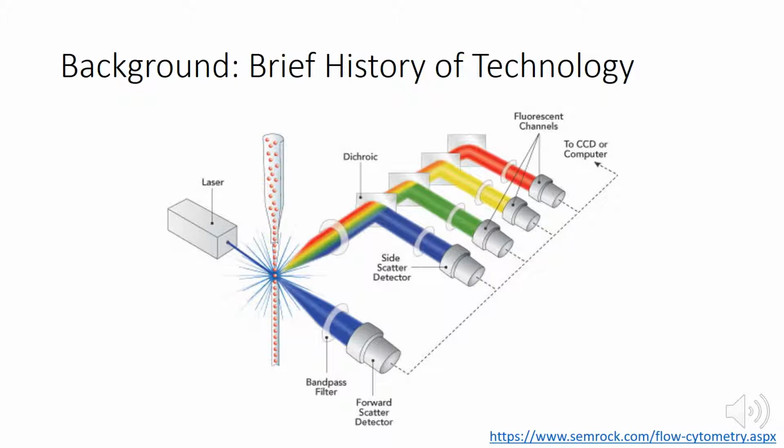One of the important criteria for flow cytometry is properly positioning the particles or cells in the sample stream in front of the laser. The most common way to do this is with hydrodynamic focusing via a sheath fluid. However, this material is not so readily available outside of a well-equipped laboratory, and this paper aims to describe a way to circumvent this problem.